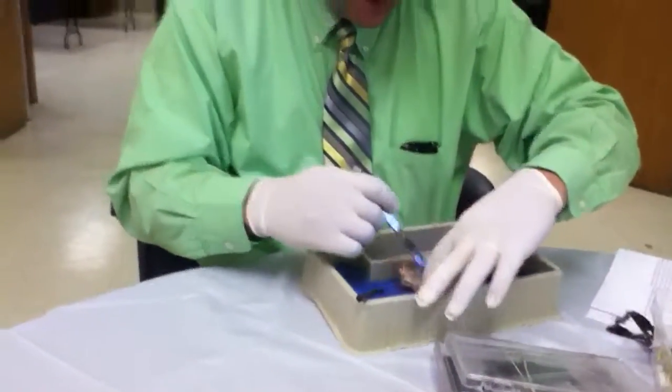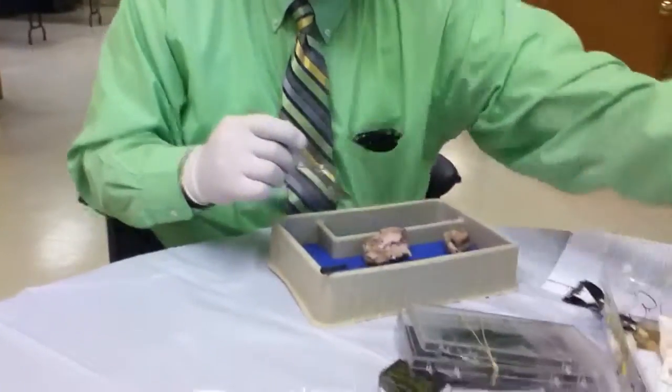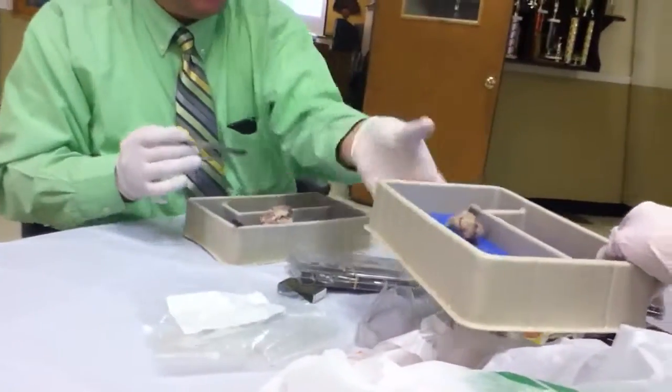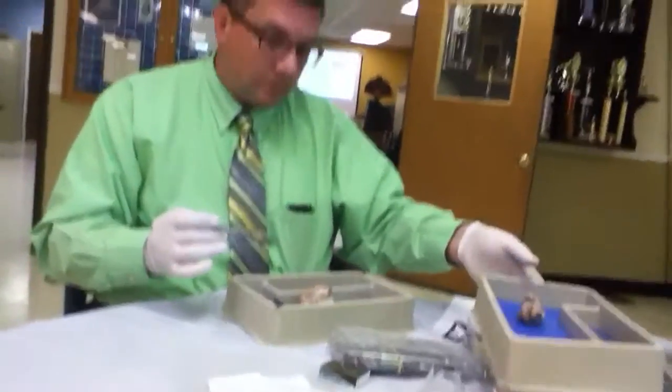So we remove the cerebellum and everybody has their own cerebrum. We'll come back in just a minute and dissect the cerebellum. What's this? What is this?